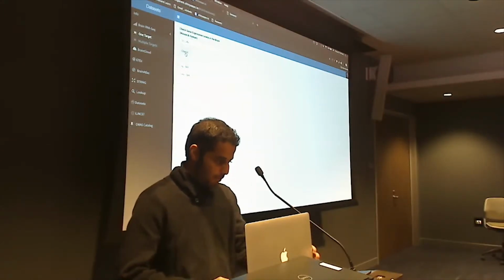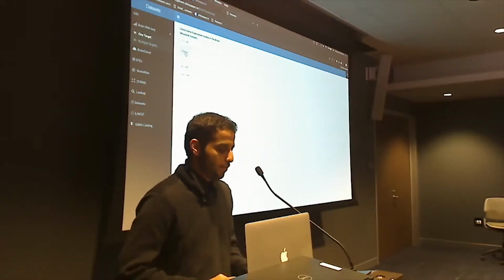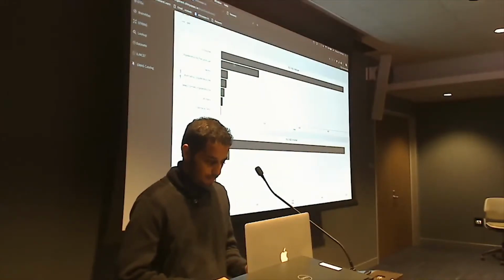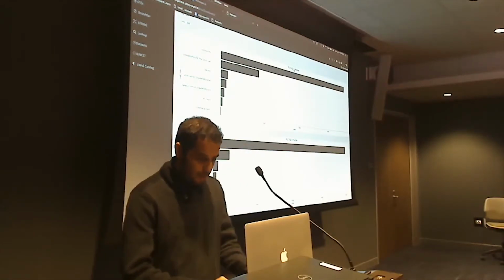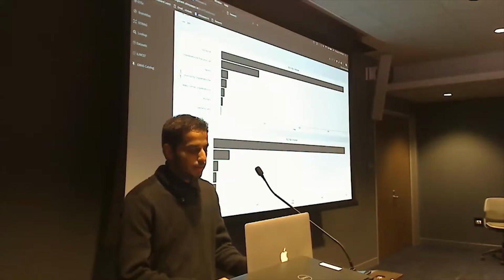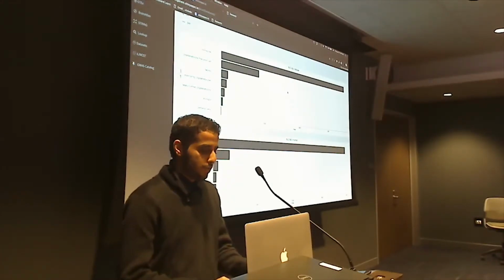Yeah, so this is the brain RNA-seq. It's going to give you the expression levels in different cell types of the brain for mouse and human. So we have the mouse here, and then the human, and these are the FPKM values, which is fragments per kilobase per million. It's just a value for transcriptome expression levels.